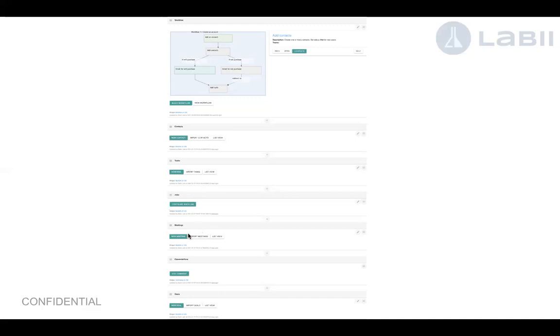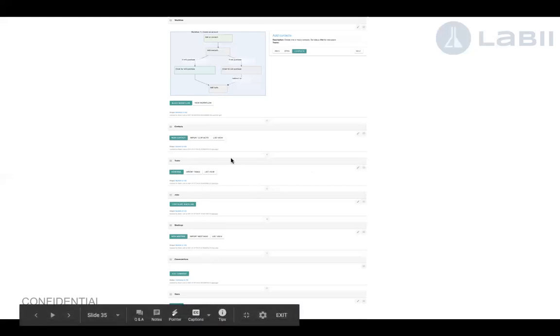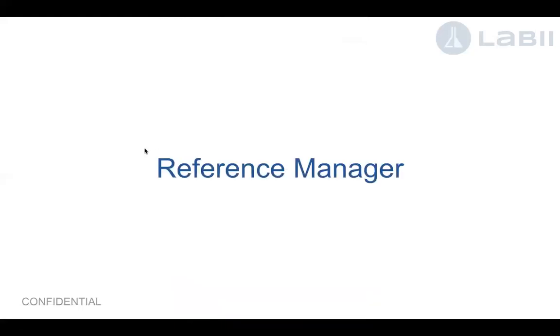And then after that, you can also document every single meeting. What's the conversation you have with this particular customer? So that all can be done. What's the deal you already closed? The function used over here is called a backlink, which means you can link all the different kinds of data into one same section, and then you're able to just overview different details in one of the nodes directly inside.